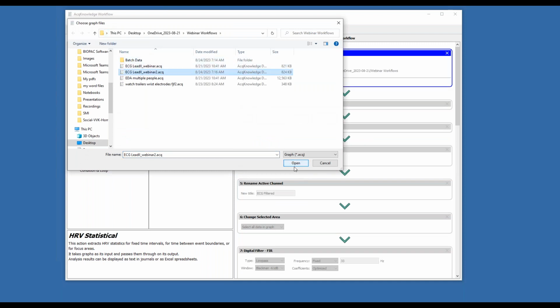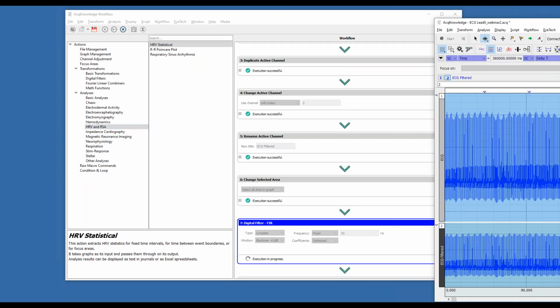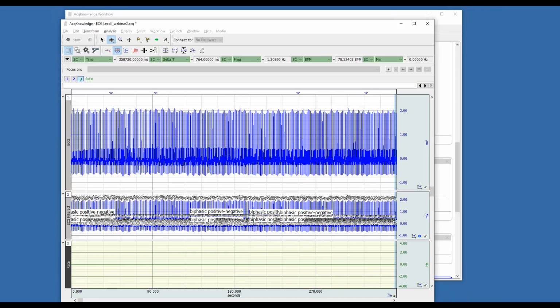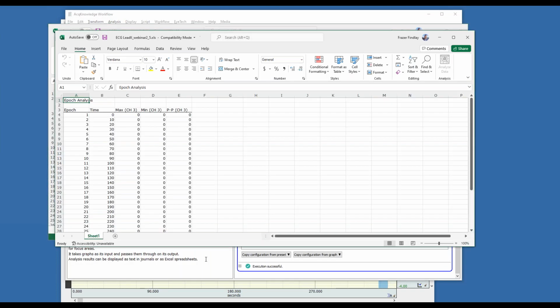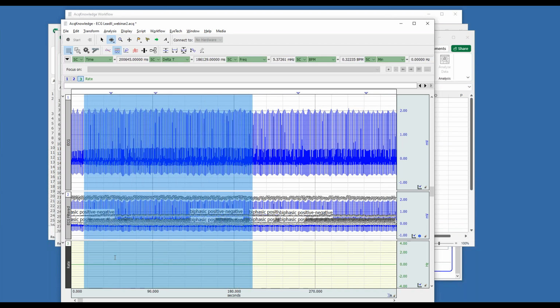Oops, pick a channel, fell asleep. Here we go. Okay. So now if I come back in here, I can see that my rate calculation, I had changed channels. It's stuck to 2, so I need to go in there and correct that. Let's just do that.